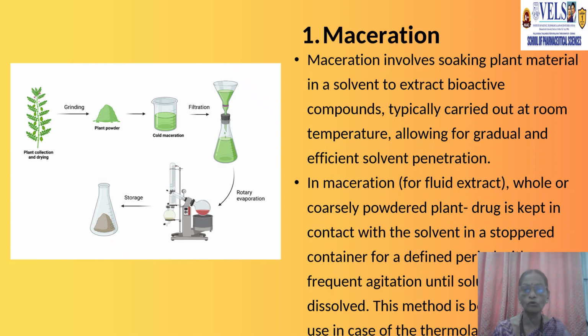In maceration, the whole or coarsely powdered plant material is kept in contact with the solvent in a stoppered container for a definite period of time with frequent agitation until the solute particles are completely extracted or dissolved. This method is best used in the case of thermolabile substances.